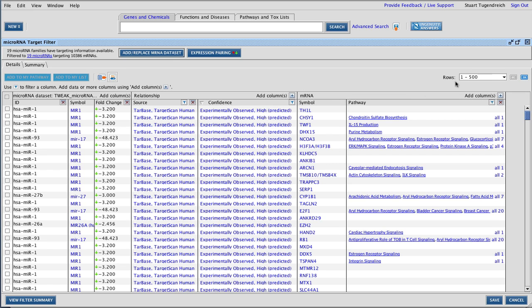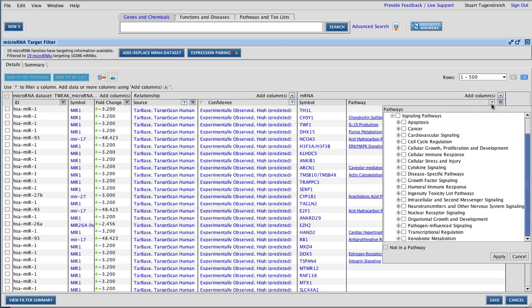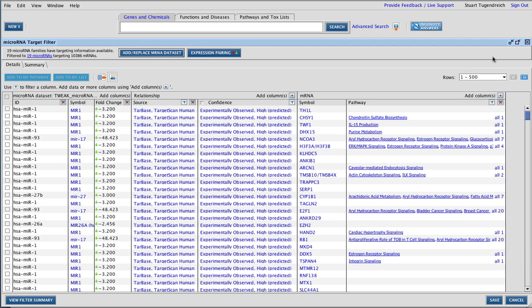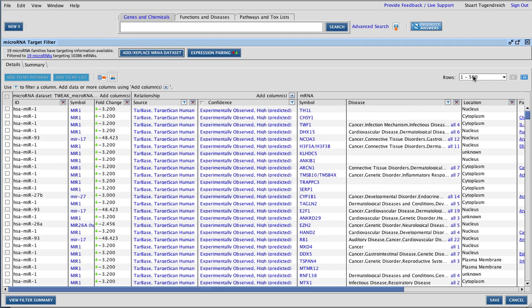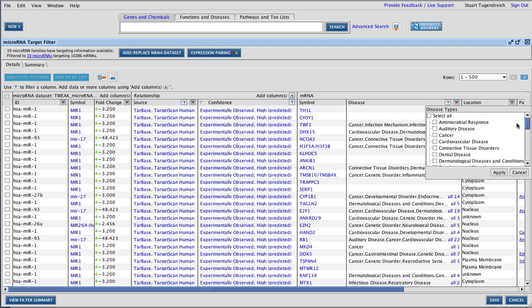How do I filter down to the most important ones? I can use the known biology of the mRNAs, such as the pathways they are in, and I can add additional columns such as disease or cellular location. I will filter the genes that are associated with the relevant disease, skeletal and muscular disorders.